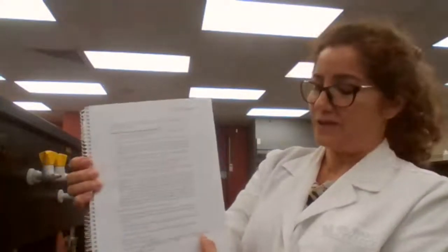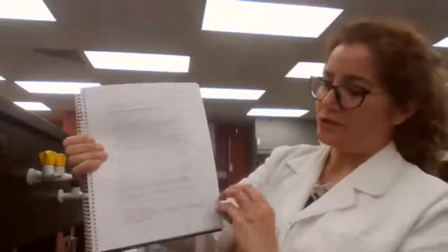If you have moles of the product multiplied by the molar mass of the product, that would give you the theoretical yield. The procedure on page 31 is used to calculate theoretical yield. Actual yield is the mass of the product at the end of the experiment. So when we have the sample already filtered and dry, and before measuring the melting point, you put it on the balance and you record the mass of your product. That would be the actual yield. And actual divided by theoretical gives you percent yield.